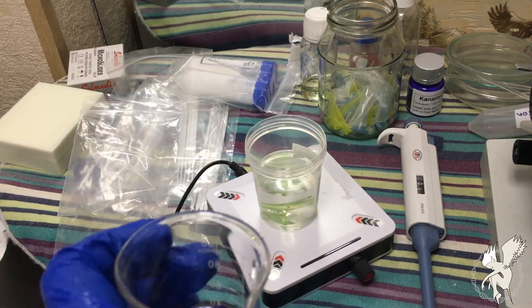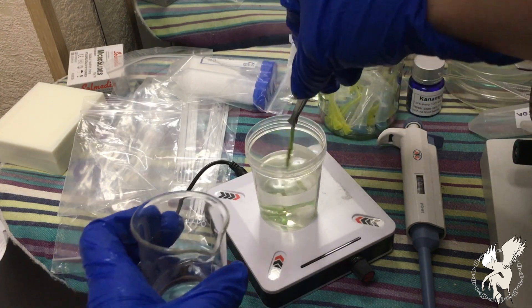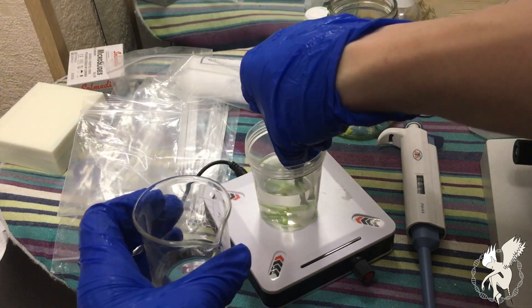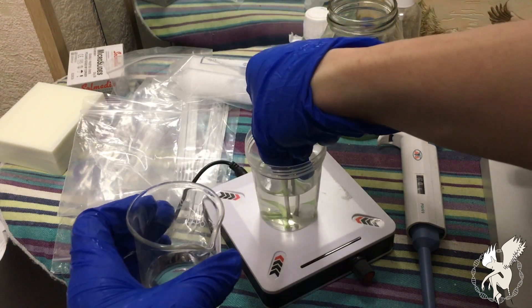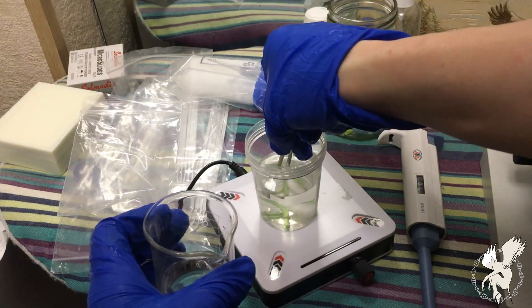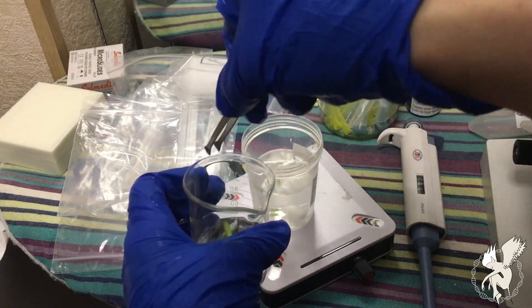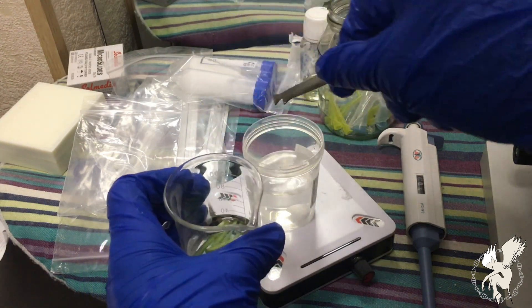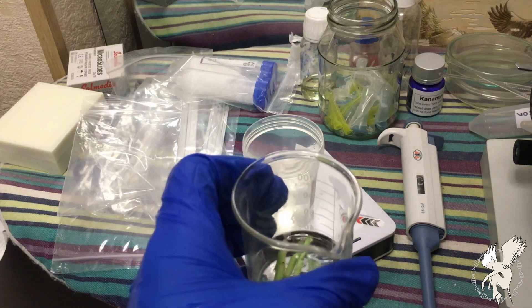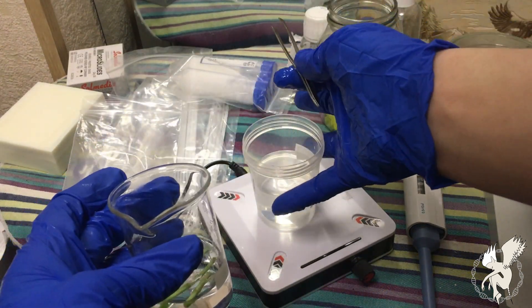Now transfer your plants into distilled sterile water and remember — this water must be sterile. The whole reason we did the cleaning process with ethyl alcohol and bleach was to remove and kill off every microbe around the plant, so you definitely need sterile water for this procedure. Let them sit in the sterile water for about five minutes.